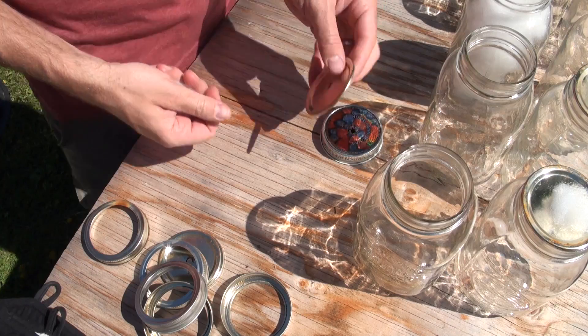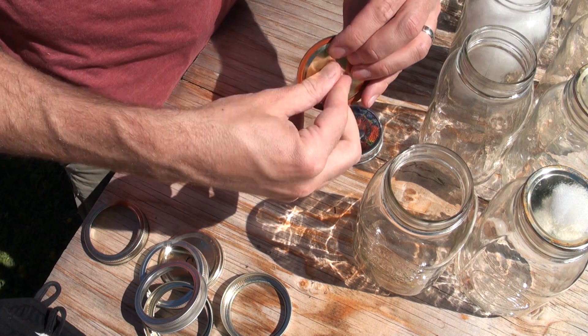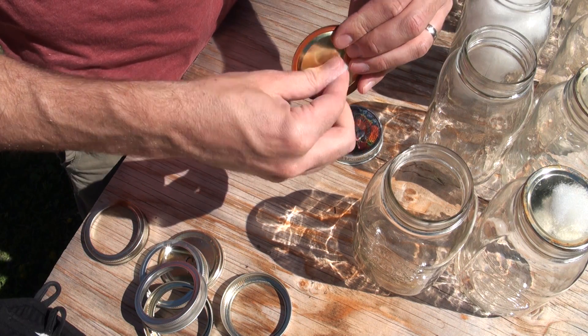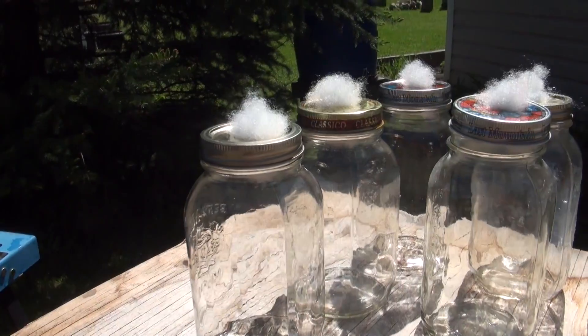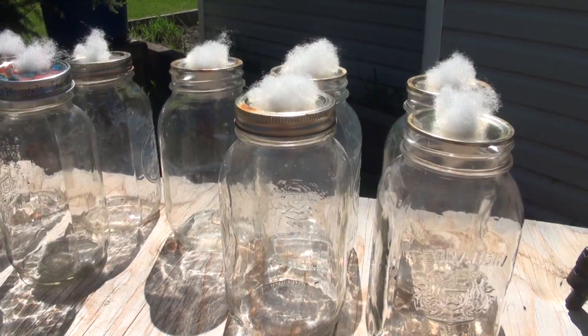We're going to be growing our grain spawn in these quart-sized mason jars. They're pretty much just a perfect size for first-generation grain spawn and I've modified them slightly. All I've really done is drilled a quarter-inch hole and pulled in some pillow stuffing. All that does is act as a filter, allowing the mushroom mycelium to breathe as it's growing throughout the grain while at the same time preventing contamination from entering the top.